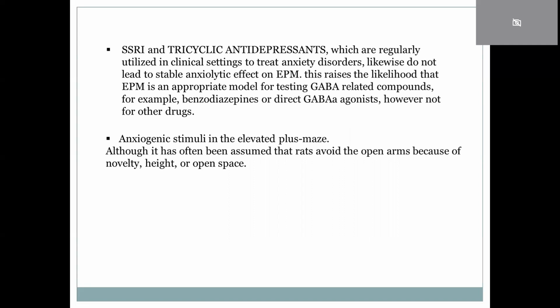The elevated plus maze is a simple yet effective assessment of anxiety and the effects of anxiety relieving or anxiety causing drugs. Basically, anxiolytic drugs are anti-anxiety drugs that reduce anxiety. This effect is in contrast to anxiogenic effects, which increase anxiety.